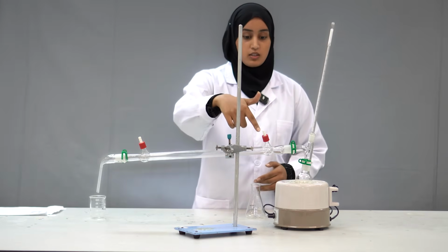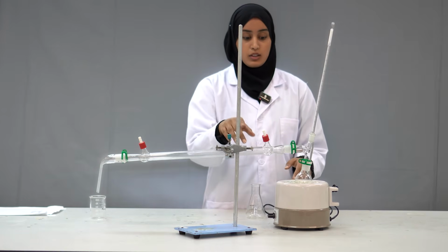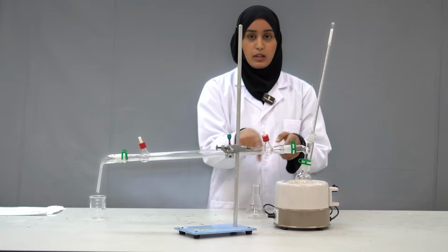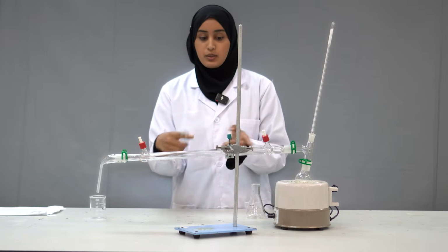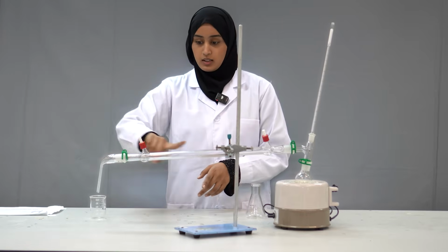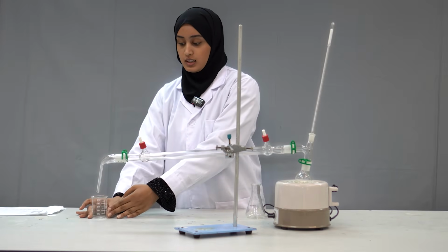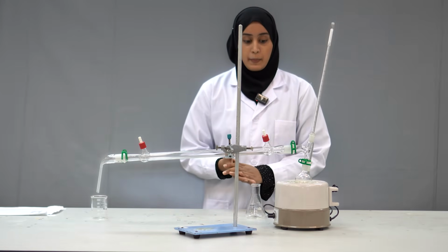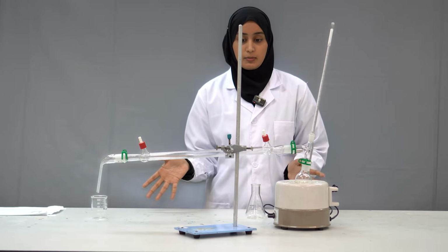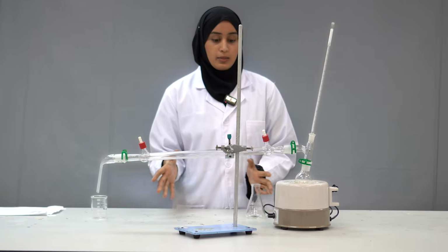When DCM is getting vaporized, at the same time, there is cooled water running through the outer jacket of the condenser, so that this cold water will help the vapor to cool down, so that it will turn back into a liquid and it will go like this and get collected. DCM will get collected in this receiving flask. This distillation setup is really small scale and we only use it for labs.